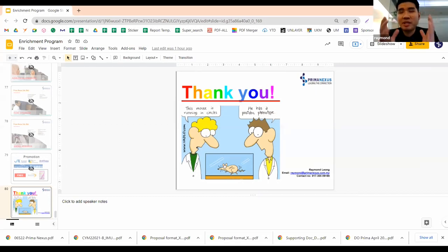Oh, I see where you're coming from. Meaning that you would like to get, let's say, splenocyte or brain cell, and isolate those from animals. Which animal is a suitable model? Actually, if done properly, any model, you can do that. For splenocyte and hepatocyte, I come across a few research groups that use mice. For brain, I come across groups that use rat. So I think with all the animal models, if you would like to get their primary cells out, it should be okay. You just have to find the proper region and the proper method to process that. For example, if you want to get splenocyte, you have to do a proper spin and then use something to isolate them out.